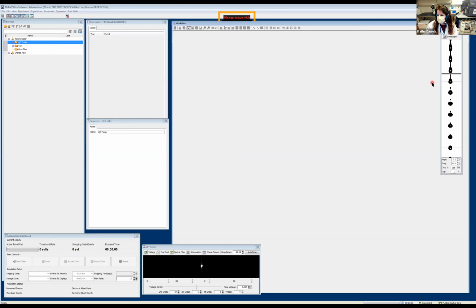And it's important to note here, and this is something I didn't say just yet, that up at the very top of this break-off point window you see the size of the nozzle, and that's written into the configuration. So it will tell you, when you're turning on, what size nozzle you're working with, and that's controlled through the instrument configuration.